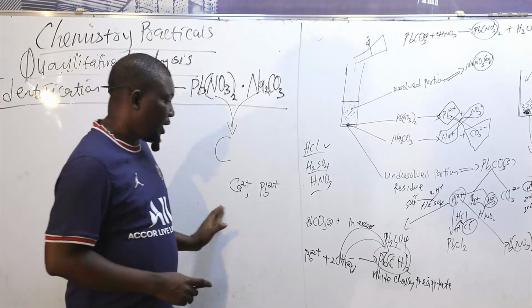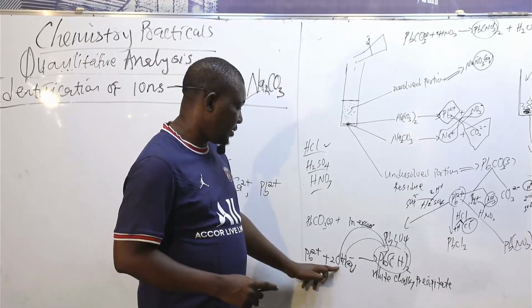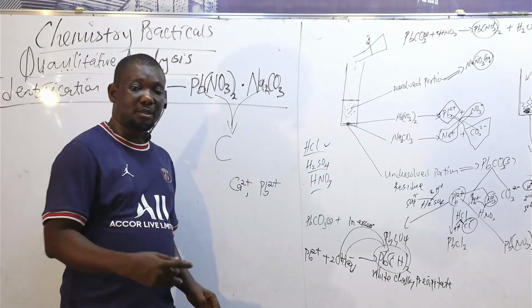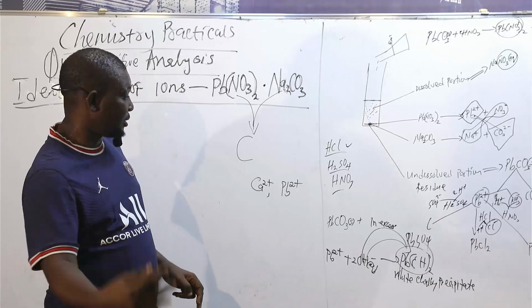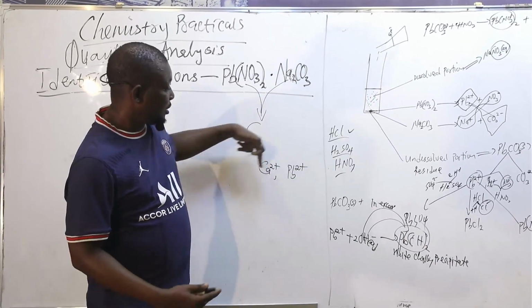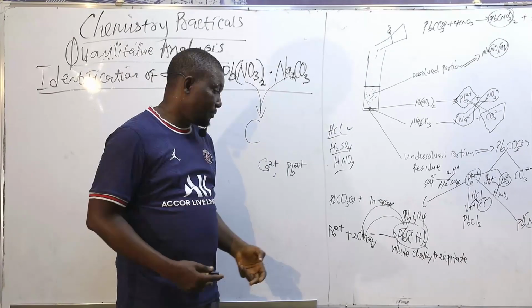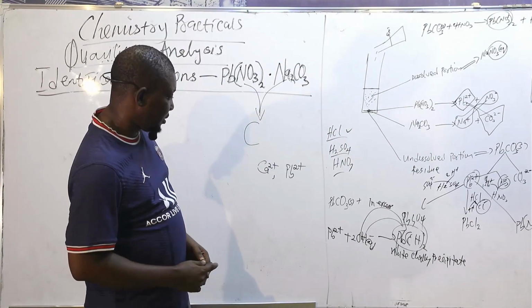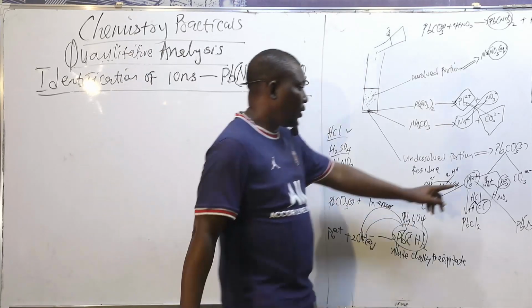So these are the two at this point where you added drop of this. You have to put this. But in my last class in this video, I'm going to explain the table, how this will be reported most often: what you report, the column of inference. Okay, that is what you do with the first portion.